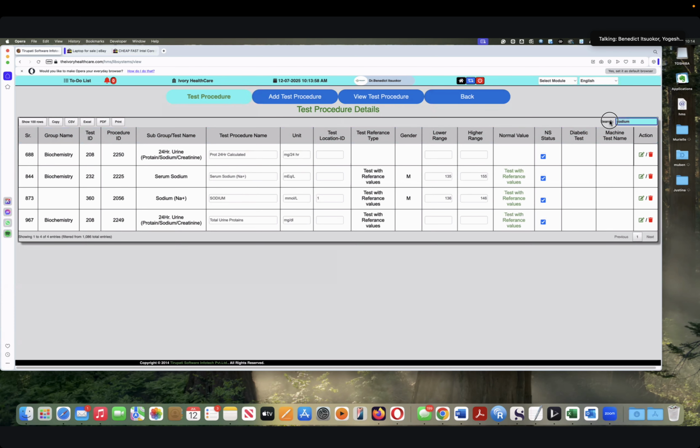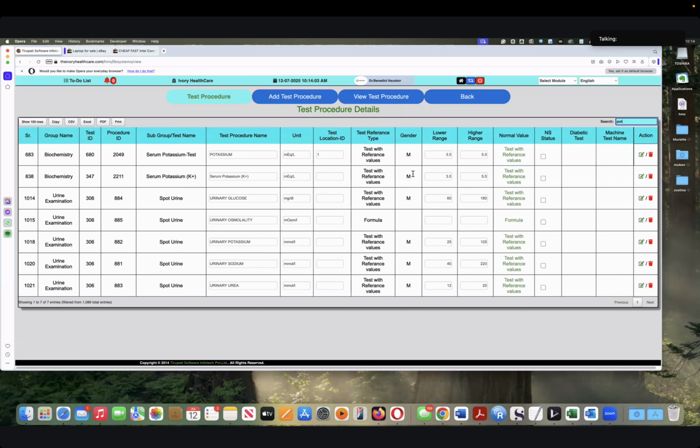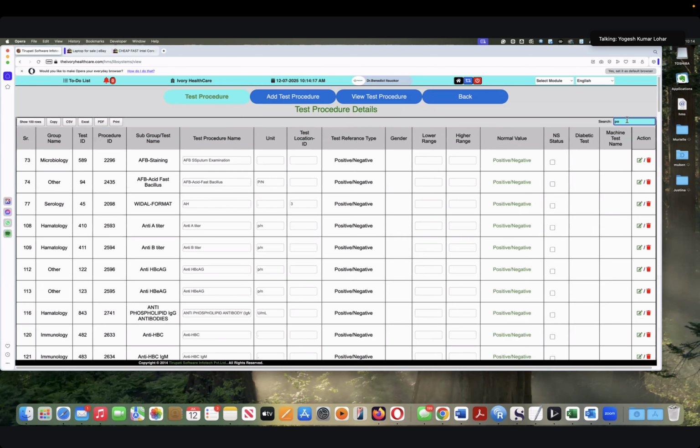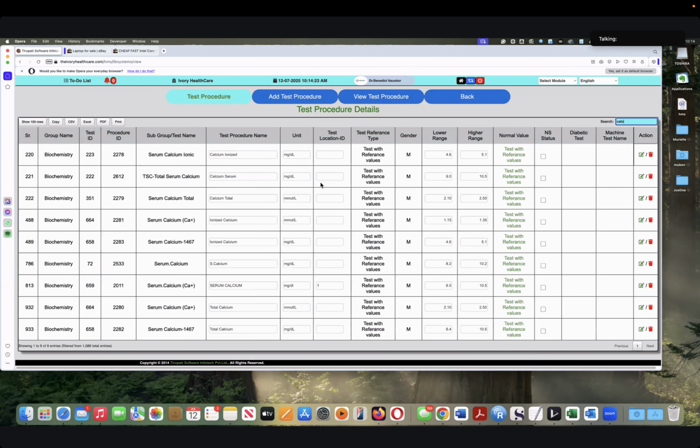Okay, similarly like potassium, one second, if we have serum potassium, mention a tick mark yes, and if there is any potassium result, you can mark from wherever we are getting the result and it needs to come into the nursing test. So we mark from here. After potassium, there is calcium for example, so you can mark the respective test that should come into the nursing desk result window once you mention it. So you can check all types of respective tests that reflect in the window.